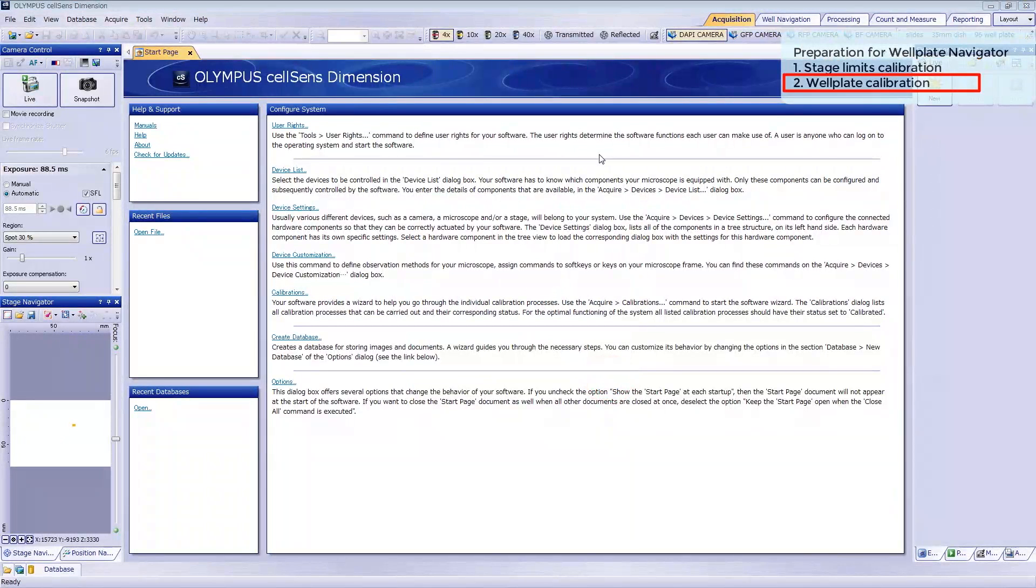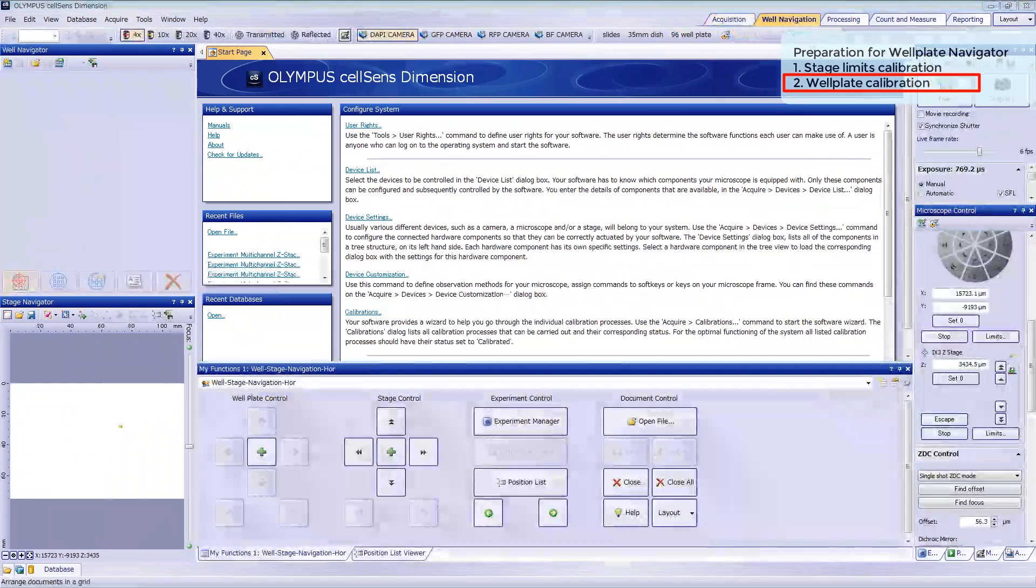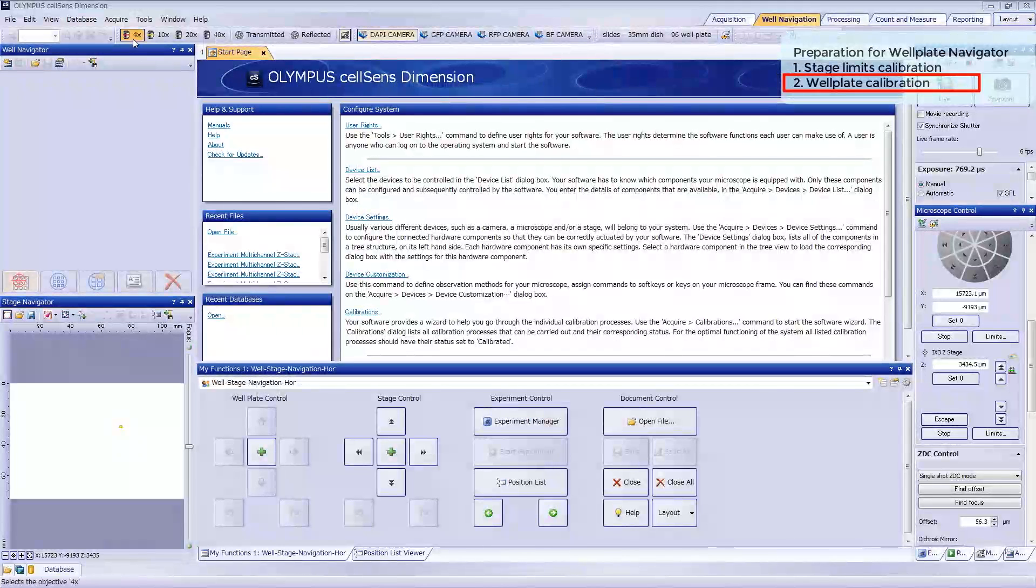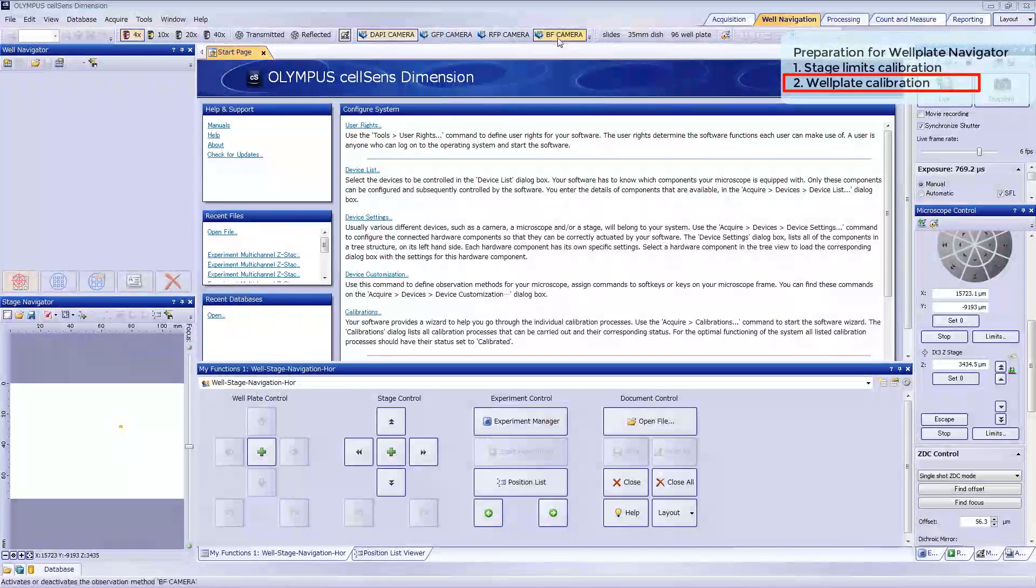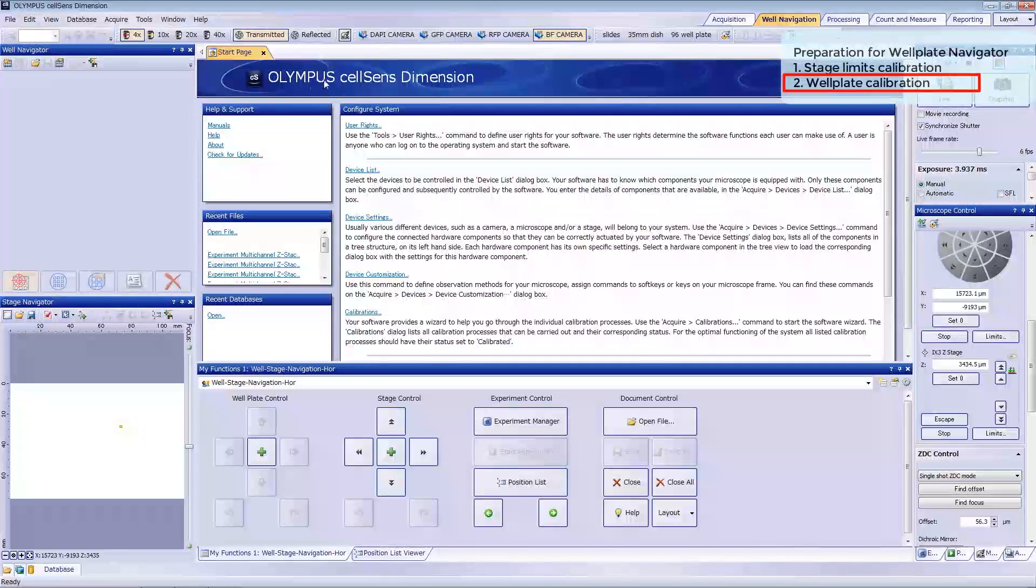Now let's register and calibrate the wellplate. Click Well Navigation in the Layout tab. Make sure that the lowest power objective lens is selected. Select the transmitted light observation method, then click New Well Plate.